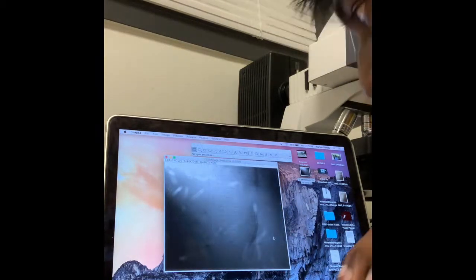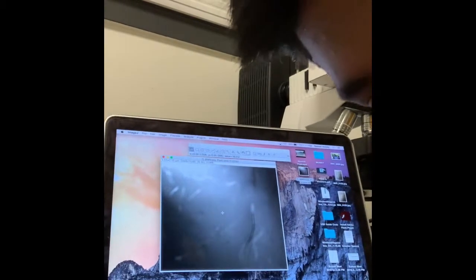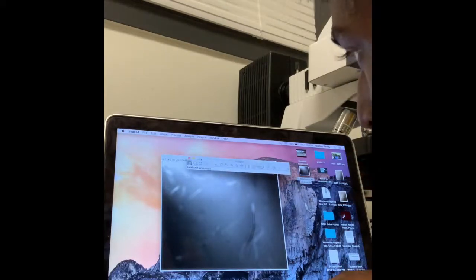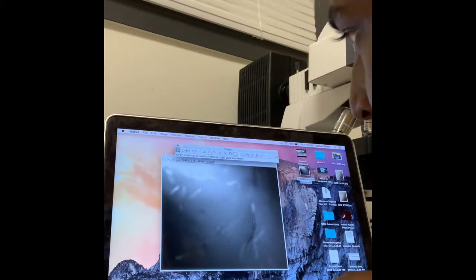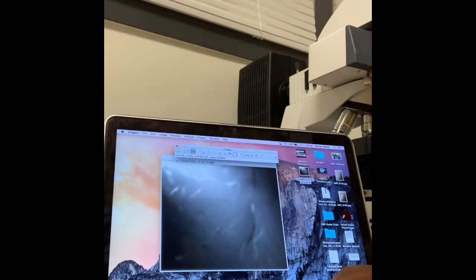So now you have set all those measurements, I assume. Now to analyze, they have this big bar up here. You want to find the image of a little bean-looking shape that says freehand selection, and press on that.